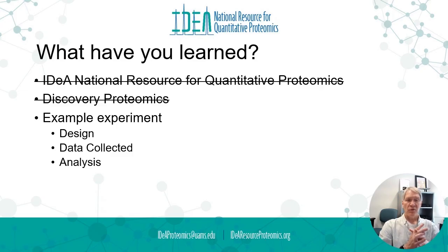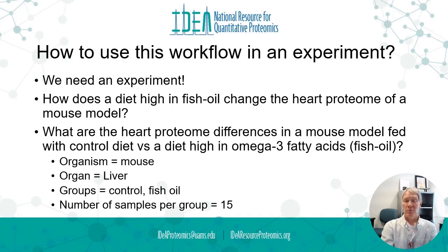So what have you learned so far? We learned a little bit about discovery proteomics just now, a crash course, and you learned a little bit about the national resource, and now we're going to talk about an experiment. So how can we use this workflow in an experiment? Well, we need an experiment. We need to have a hypothesis.